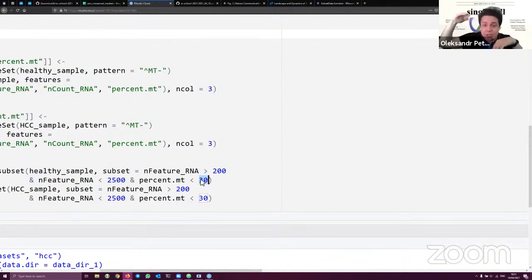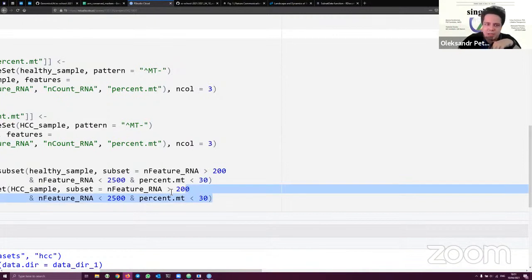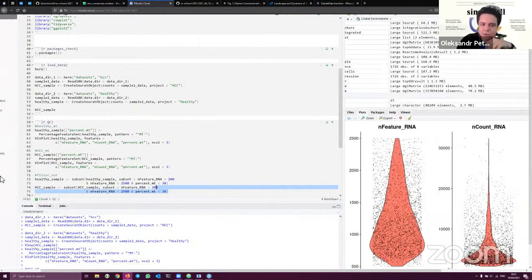They elevated the threshold up to 30% from 12 to 20 or 15. But for your tissue, it can be totally different. Here, I just propose to use the arbitrary 30% and see what happens. Don't forget that even if you are not happy with your result, you can always go back and sort differently, if you don't see any good outcome.